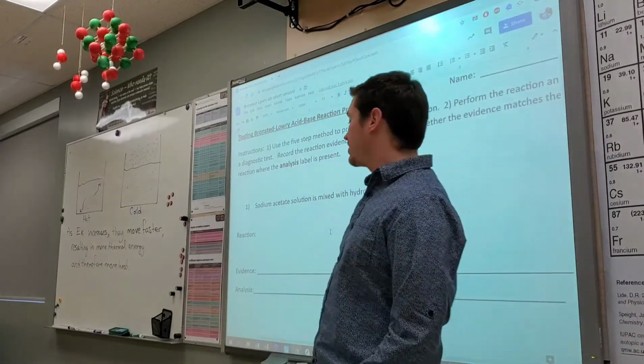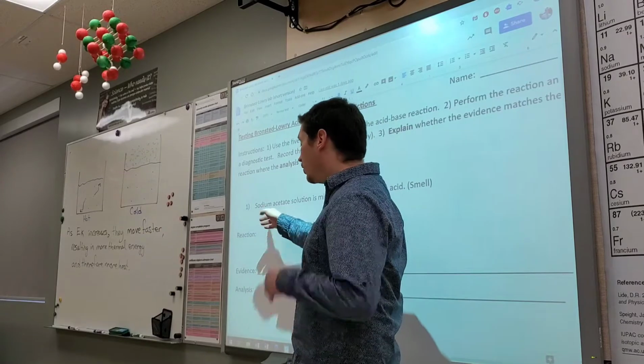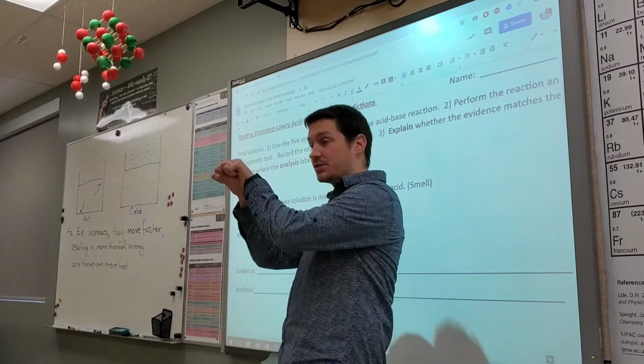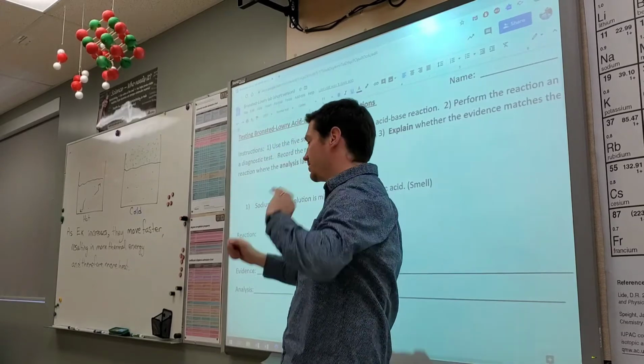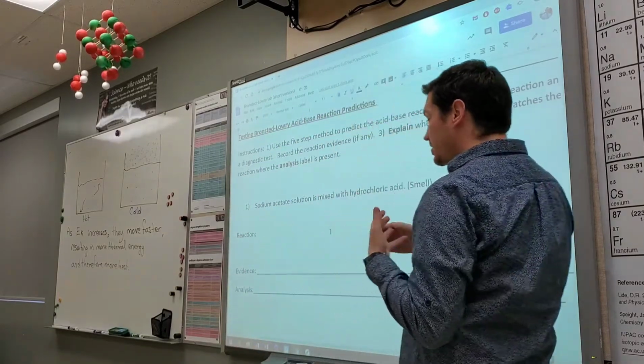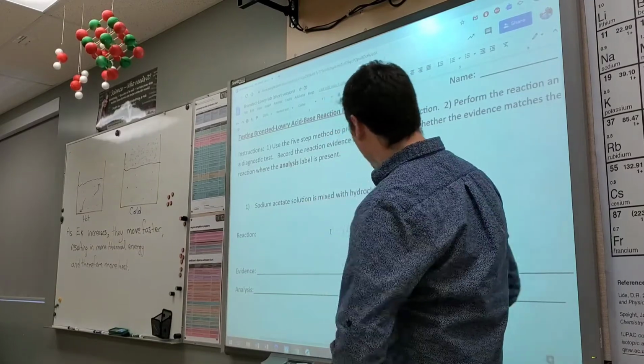So you have sodium acetate, which is an ionic compound, right? Which means you don't actually have sodium acetate in your solution. You have sodium ions and acetate ions, right? One of those might be a base, one of those might be an acid or whatever. It's being mixed with hydrochloric acid.